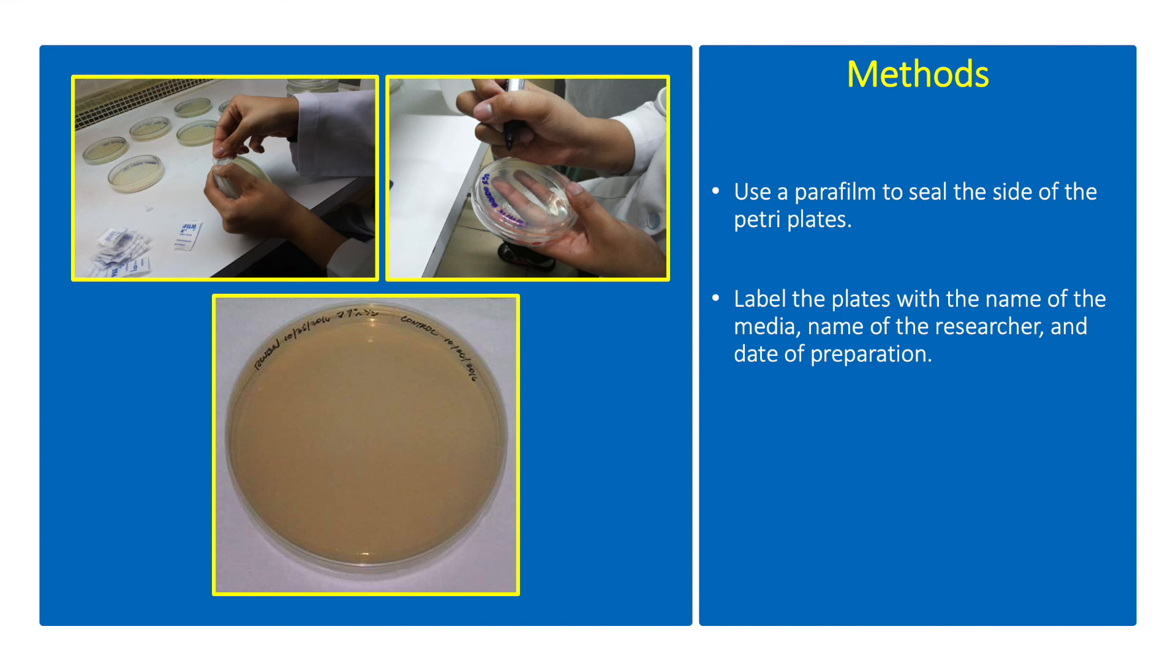Label the plates with the name of the media, name of the researcher, and date of preparation.